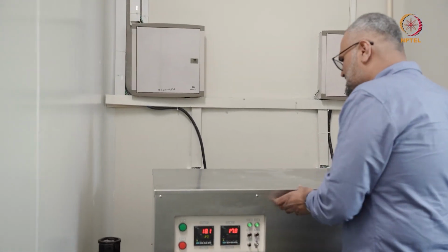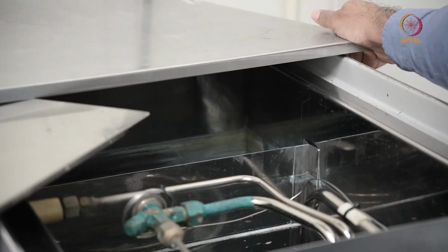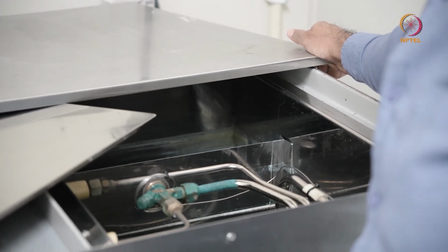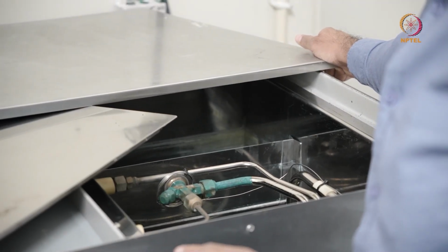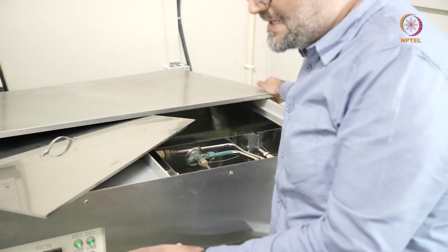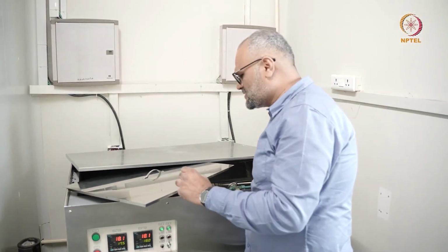If you come in closer, here's the chilled water that is being pumped in. It is typically deionized water, and as long as this is circulating, you do not have an issue with the chiller. Sometimes it so happens that you have an error on the chiller, and this could be one of the reasons why your microscope stops.